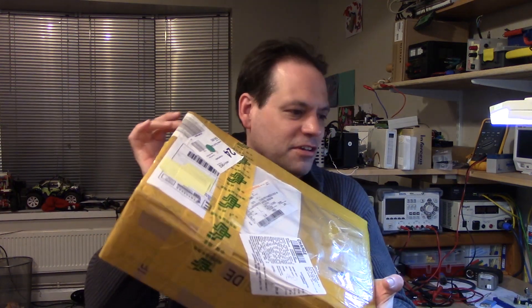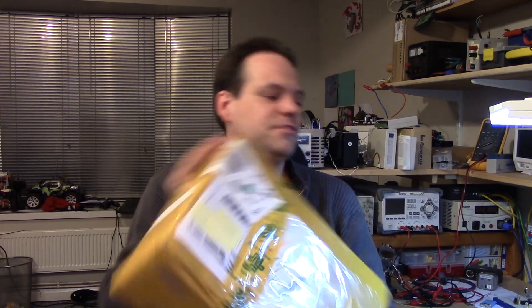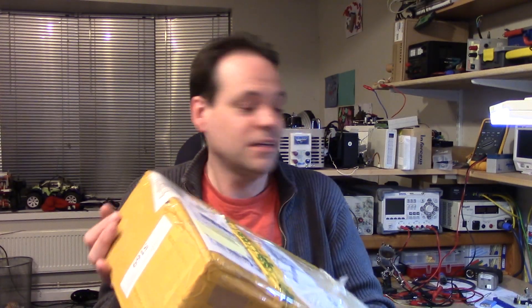Hi folks. I've got myself a new toy. I've been waiting for this for a few weeks because it's been stuck at customs, so I thought I'd have my first look with a camera pointed at it at the same time.